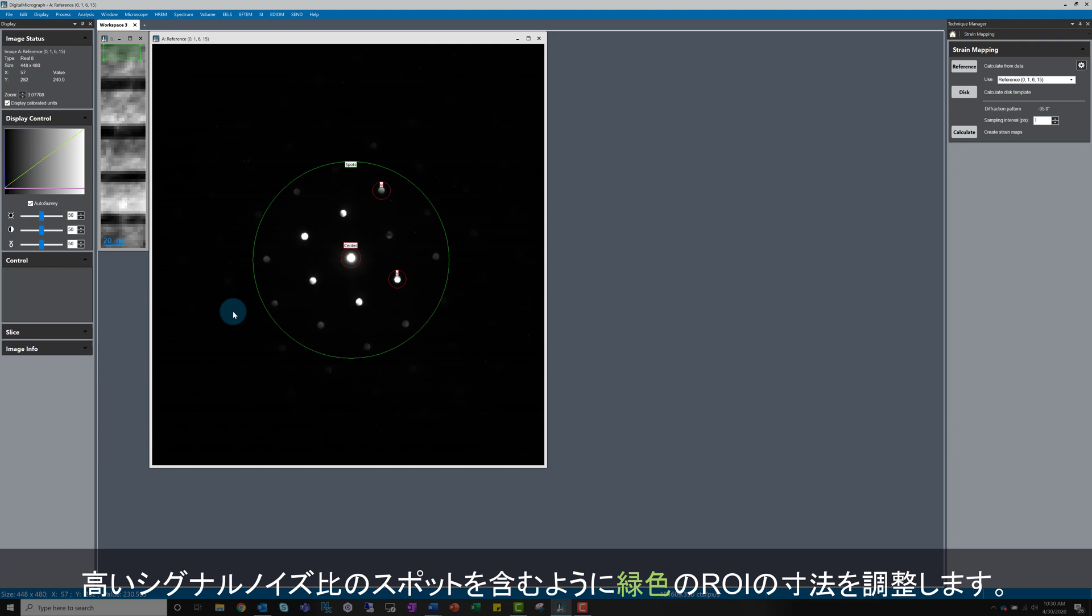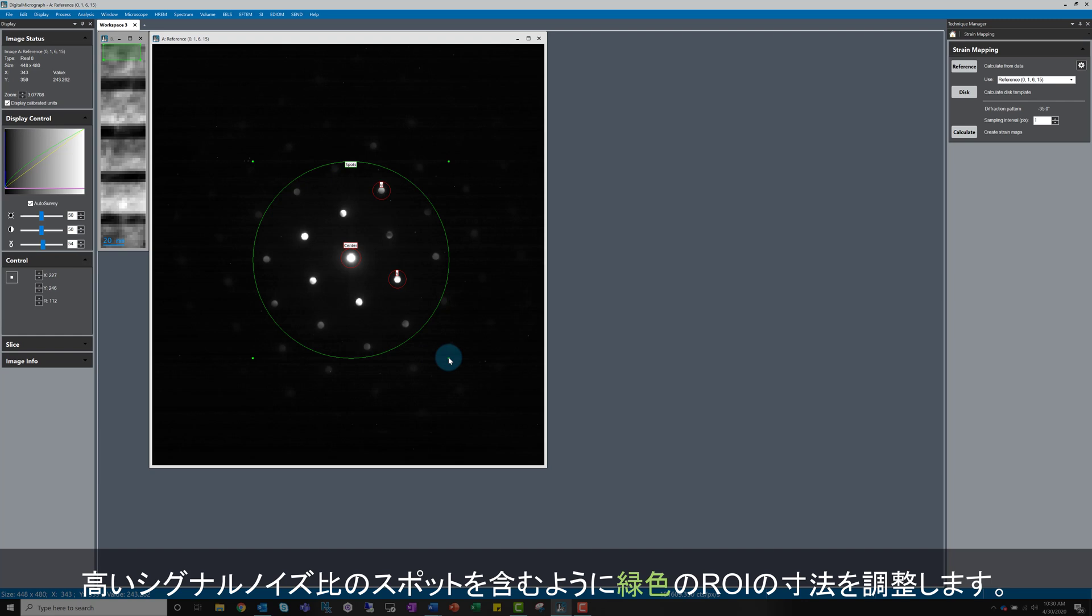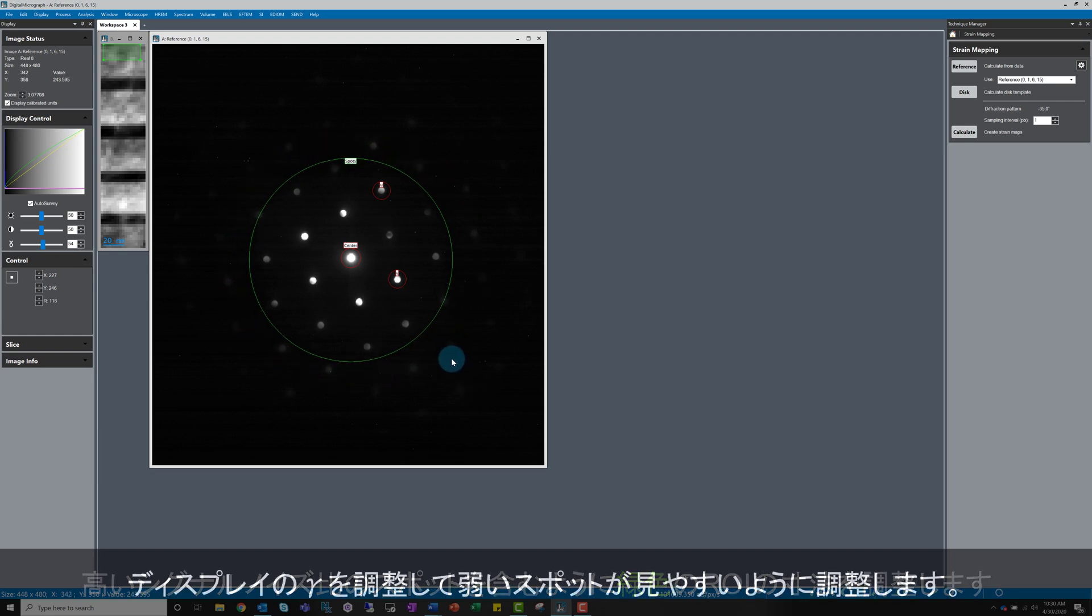Finally, resize the large green ROI to only include spots with high enough signal to noise ratio for reliable identification and tracking. I've adjusted the display gamma a little bit here to help me see some of the fainter spots more easily.